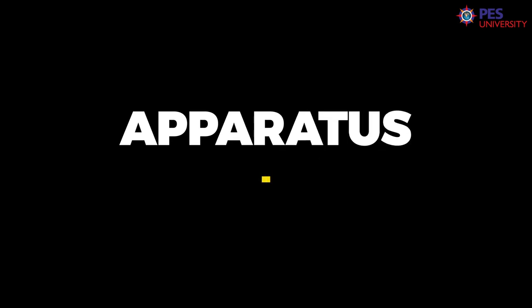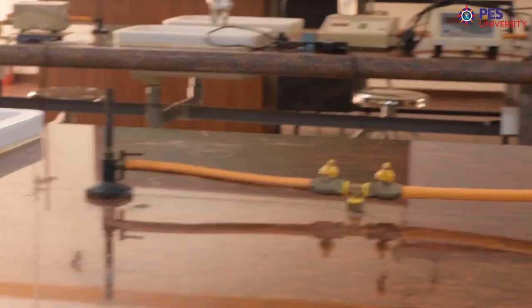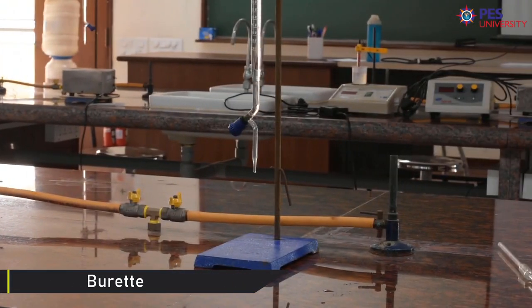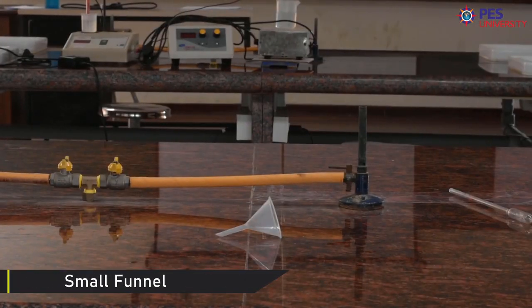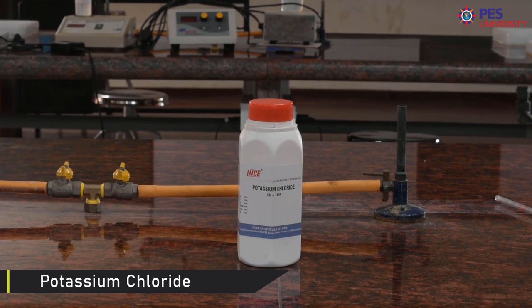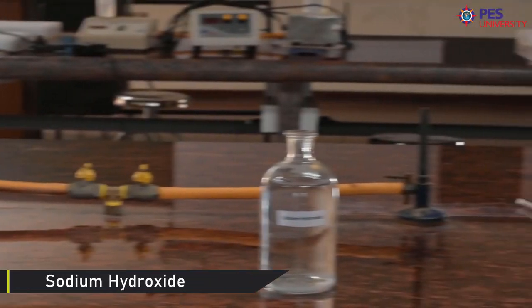The apparatus required: you need distilled water, spatula, 10 ml pipette, 200 ml volumetric flasks, 2 beakers, conductometer which has a conductivity cell, burette, small funnel. Chemicals required for this: potassium chloride salt, acid mixture, that is HCl and acetic acid mixture, sodium hydroxide.